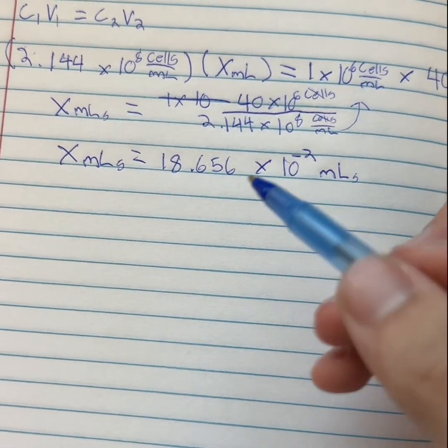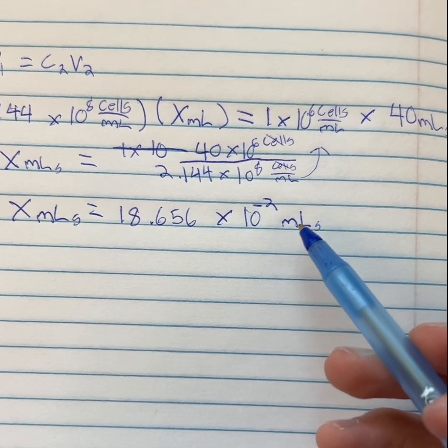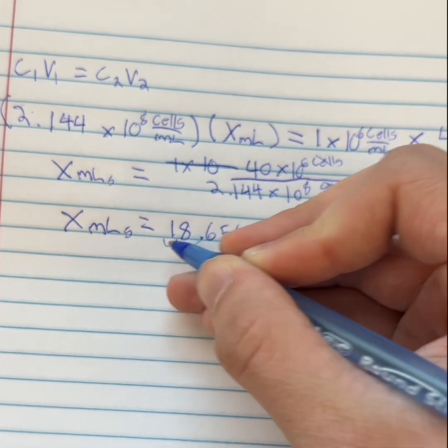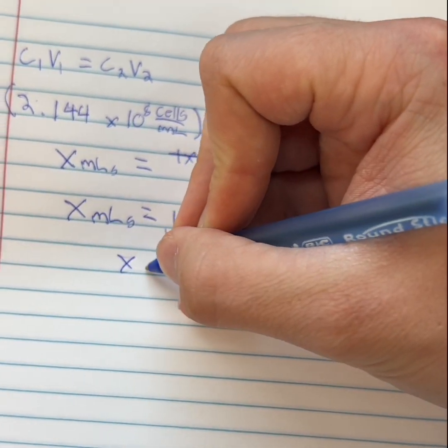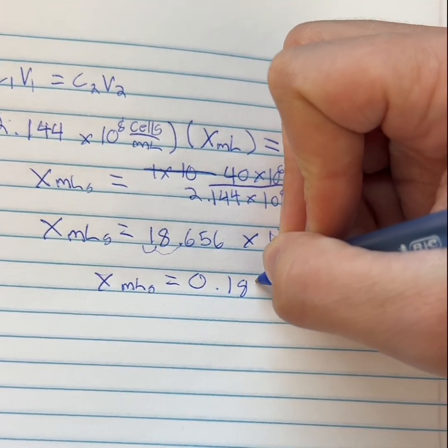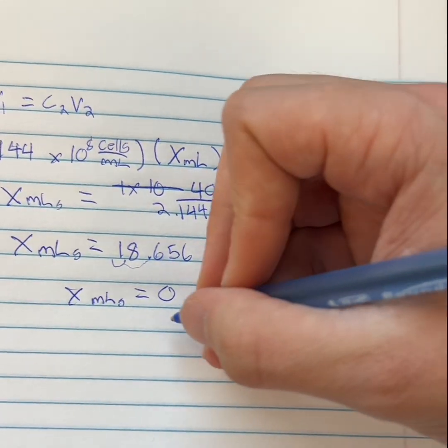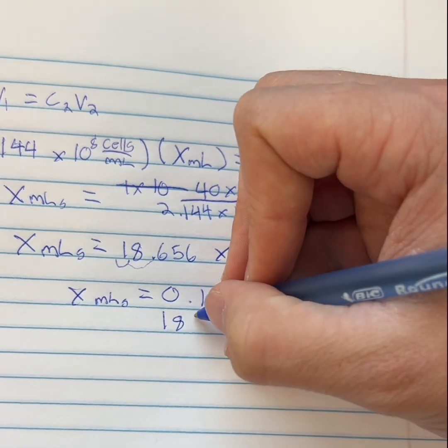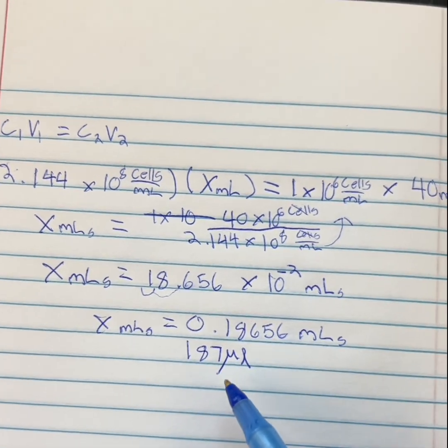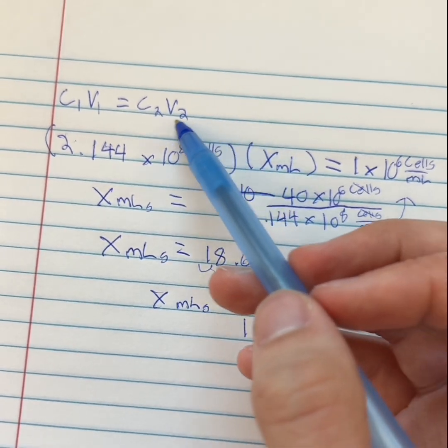We plugged that into the calculator and we got 18.656 times 10 to the negative second milliliters. We're just going to move the decimal place over twice because of the 10 to the second. The amount you're going to get is 0.18656 mils, which is the same as 187 microliters.